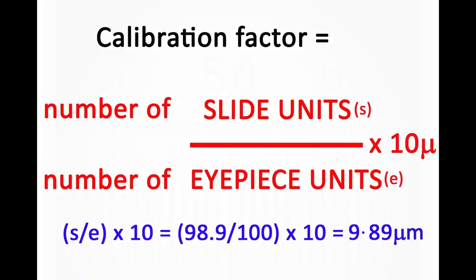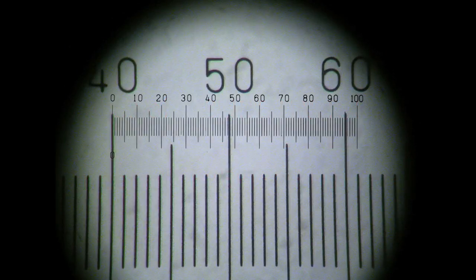Let's increase magnification. Remember what I've said about centering your subject, so place the slide scale in the center of your field of view and switch to the 40x objective. Now the focusing point will not be far off from where it was for the 10x, so use the fine focus ring to make the scale sharp, and try and get an image with the IP scale in view that looks similar to this.